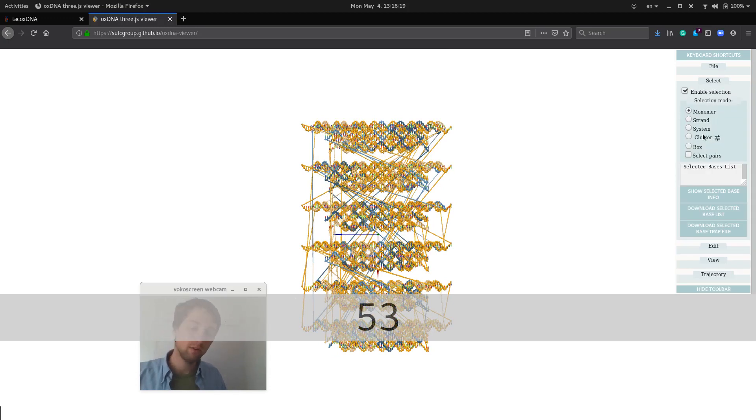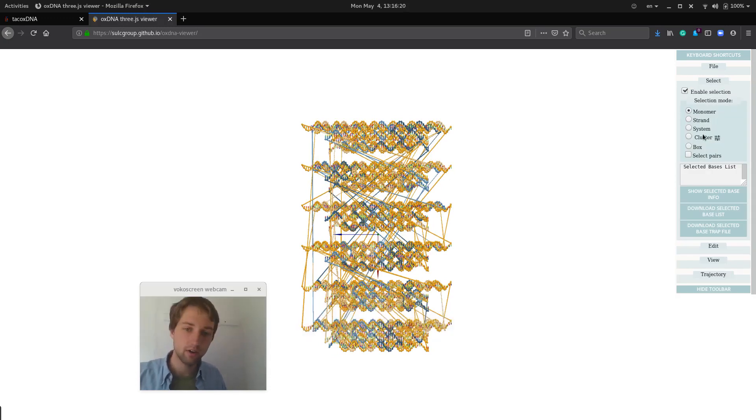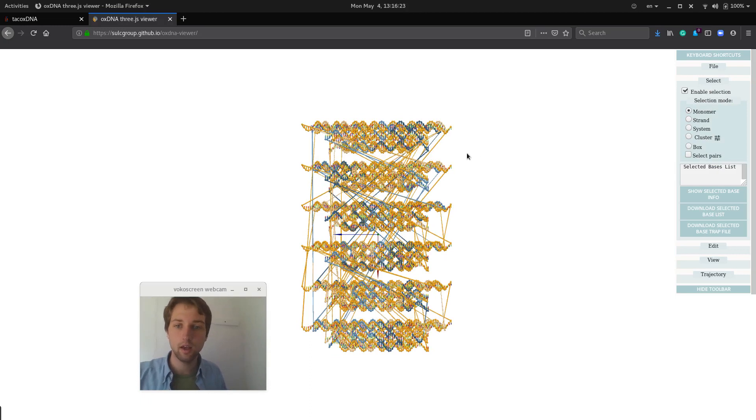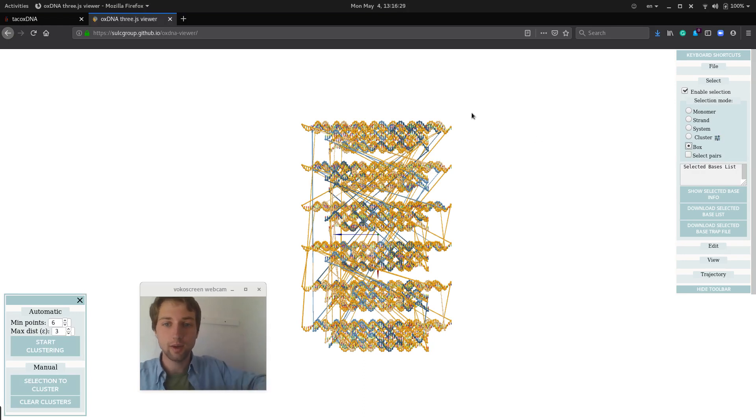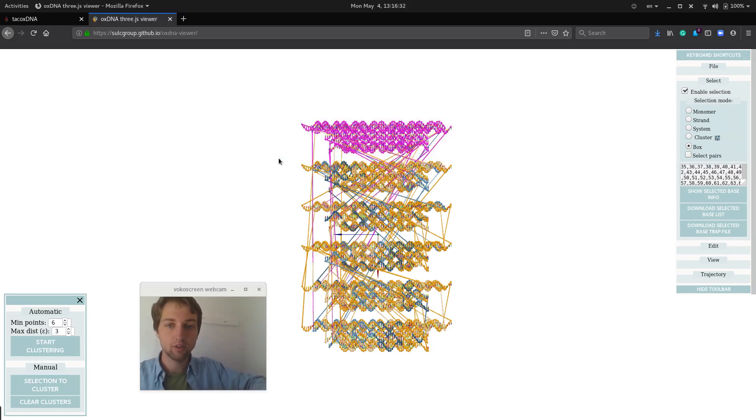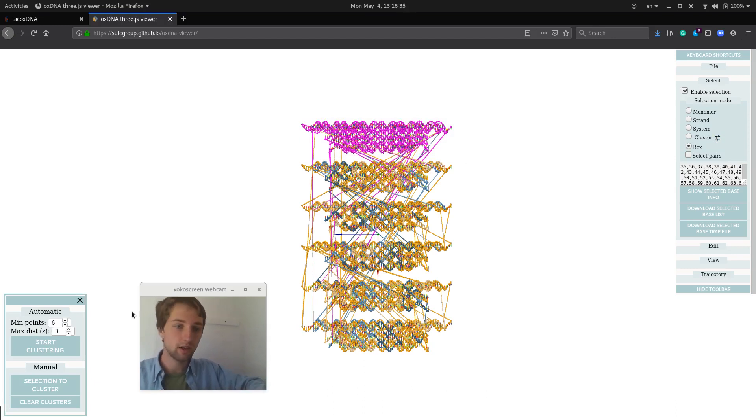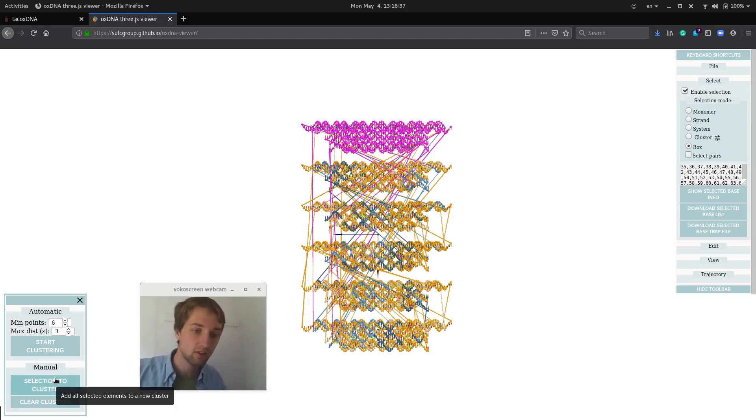You need to separate into clusters to say which components should belong together as rigid bodies. One way you could do that is to manually select boxes by this box selection tool and choose selection to cluster.